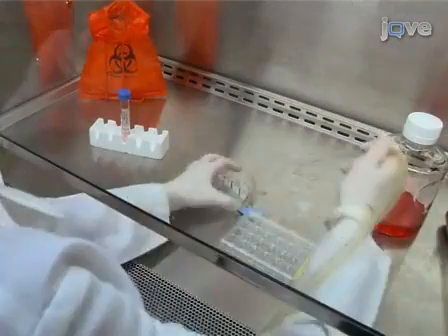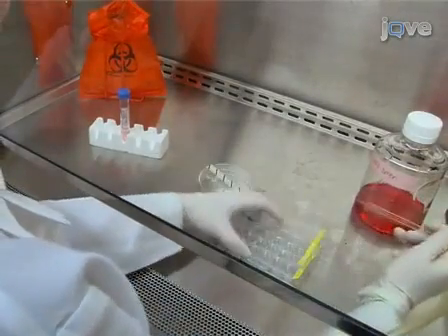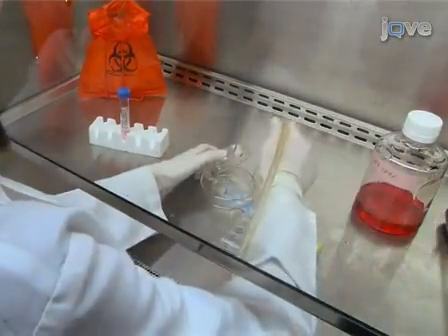Begin by placing a sterile round glass cover slip into the bottom of each well of a 24-well tissue culture plate.